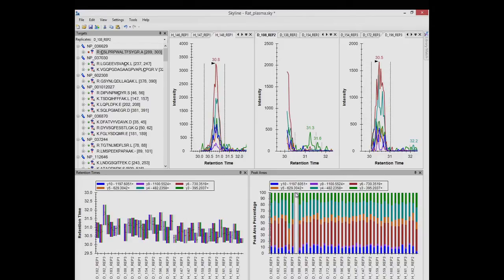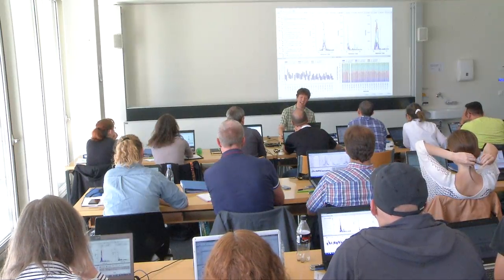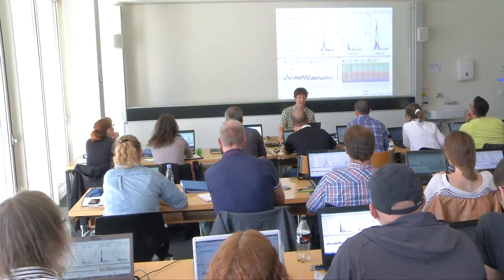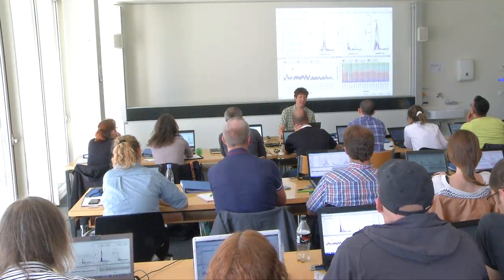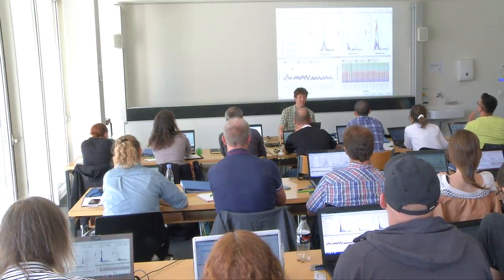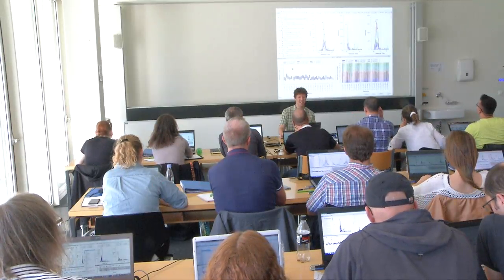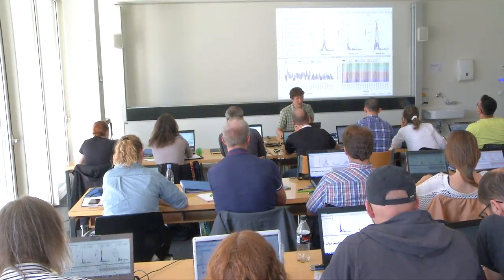And now we get a blank bar where we had that other bar, and we lose that retention time. So now I'm going to undo that, and we'll do it the other way. Just click the undo button up here, and you'll get that retention time back. And now to integrate a peak, the easiest thing to do is to click and drag under the x-axis. So if we click to the right of the peak and then drag across all the way to the end, now we get this truncated peak with a 30.1 retention time.